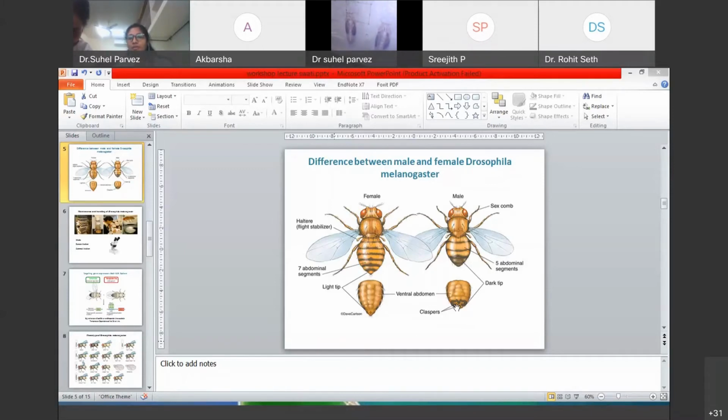In the pupal stage, we can see the fly wings and, on top of that, the eyes. At the pupal stage, we generally check the sex comb of the male fly. It's not very clear in this picture, but under the microscope it looks like a little dot in the foreleg region of the male fly. This is how we distinguish male and female pupae at the early stage. And for the setting of the process, we collect these pupae as virgin flies for the mating study.